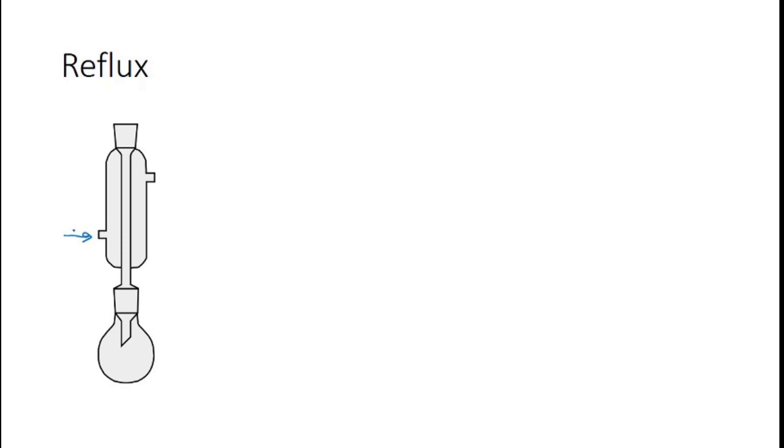Remember, for reflux, we are adding water always into the lower vent that fills this outer jacket with water, and that provides cooling for that inner column. And of course, water comes out of that upper vent up there.